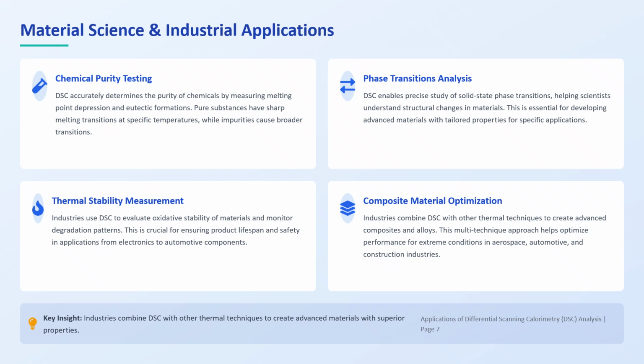For advanced materials, DSC is often combined with other thermal techniques to optimize composites and alloys designed for extreme environments such as aerospace and automotive applications.